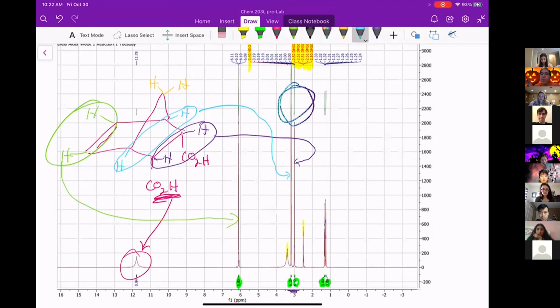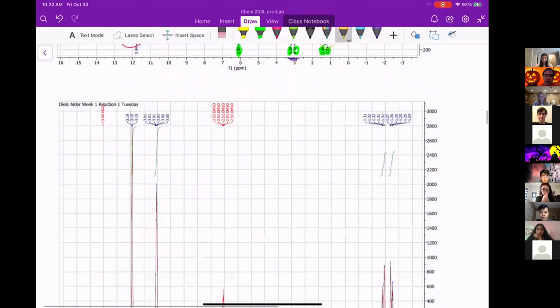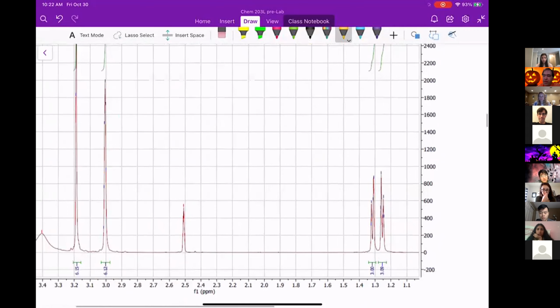So then we're left with our yellow hydrogens. And they're not near any other electron dense groups or anything like that. So I would expect them more upfield, more around 1. But something kind of weird happened, which is that I'd expect them to be here, but I've got 2 peaks in there. So this is these 2 hydrogens here. Let's zoom in and make sure that we're not just seeing an artifact. And yes, we actually do get 2 peaks down here.